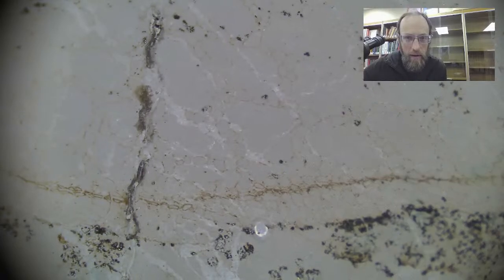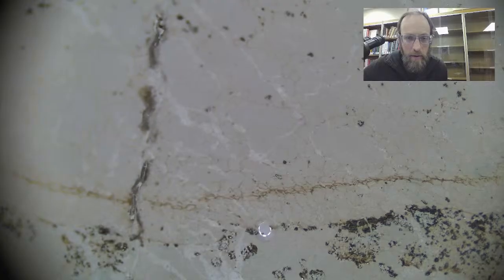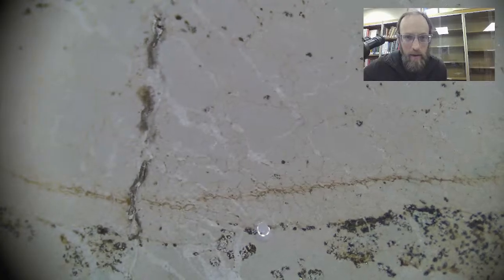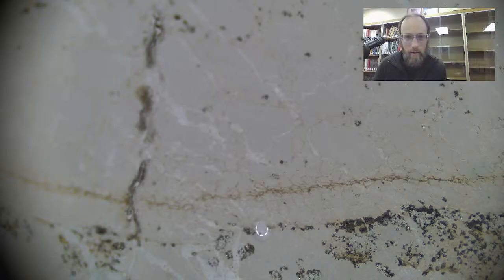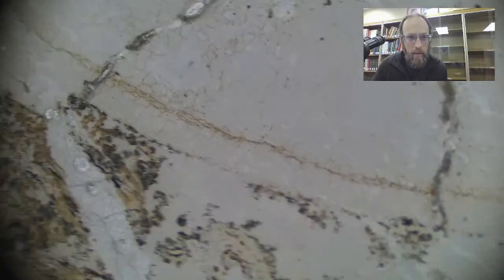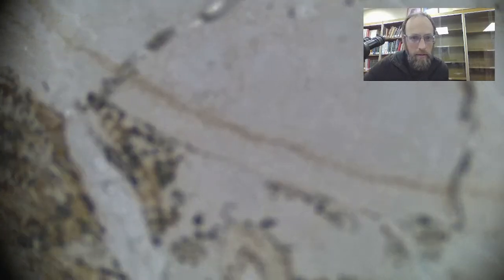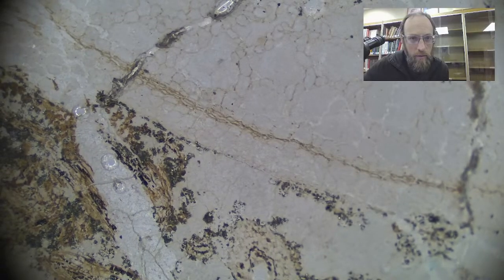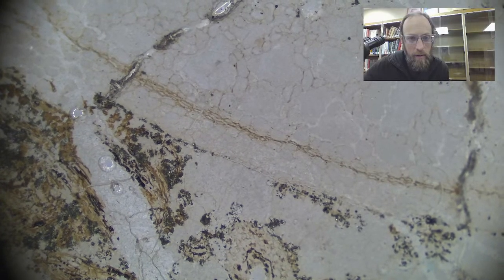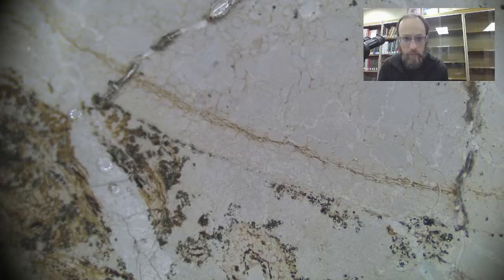But here you can see cell walls, and there are these big open spaces, intervened by a network of cells, and then you've got the root cortex, it looks like. So however this thing was growing, it's probably differentiating along the line that you see there, separating the interior of the root from the exterior.